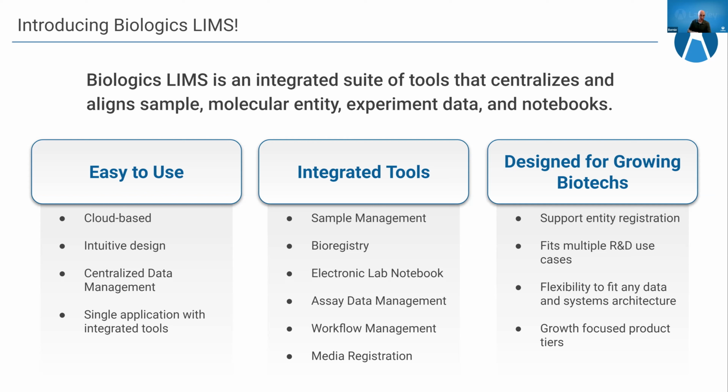Okay, so as with all of our products, Biologics LIMS was developed in partnership with our customers and our friends. We get to spend lots of time talking to them and learning from them, and that's really valuable and satisfying. We've learned the myriad ways in which efficiency is so highly prized, and that when there are too many hurdles in the way of speed, organizational adoption and even employee satisfaction can be affected. So to minimize these hurdles, we target a number of organizational problems. First and foremost is going to be that scientist buy-in.